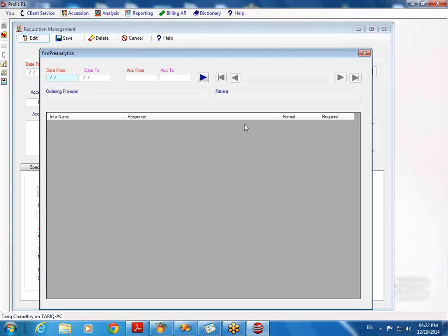Very nice. There are two kinds of pathology. I'm using the word pathology again because that most likely involves the clinical information. So there are two kinds of testing type in Prolis. One is conventional, where you could put a lot of free text into the result record, and that text means nothing to the system. Only a human can see that free text and take some meaning out of it.